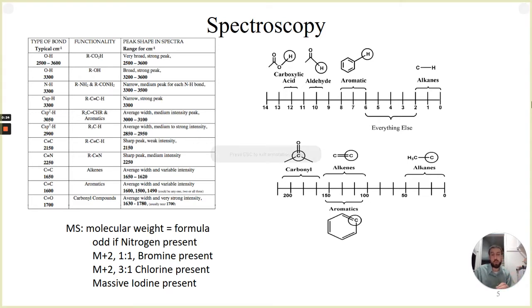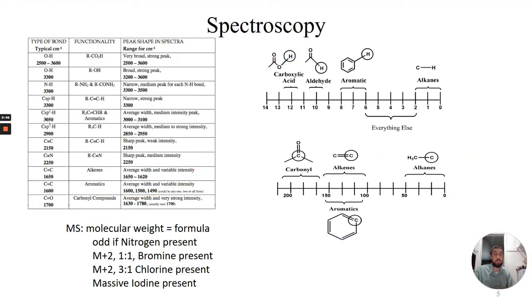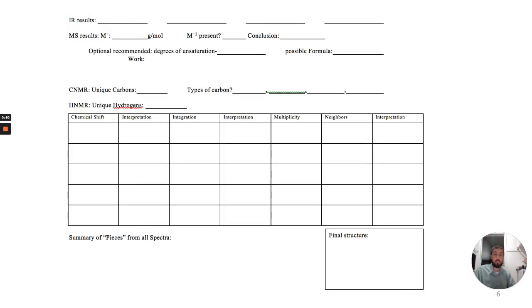Just to give you a quick labeling behind this, we're looking at our IR spectroscopy here. We're looking at our NMR over here, in particular HNMR up top and then CNMR down below, and then we have our mass spec summary right there. So this covers all the big pieces behind it, which now sets us up to do the next and exciting thing, which is start solving.